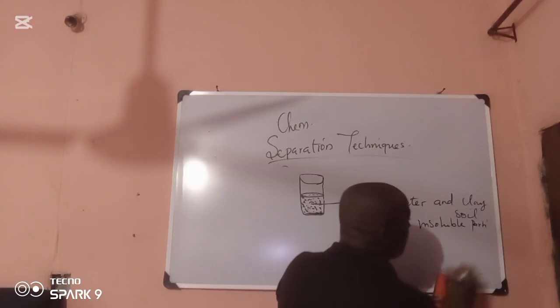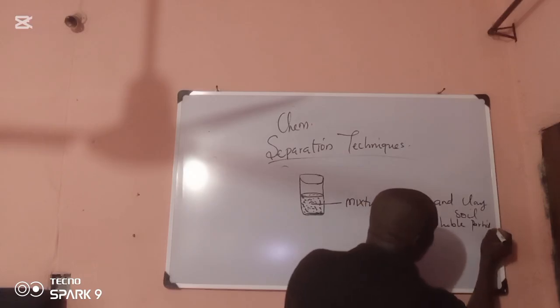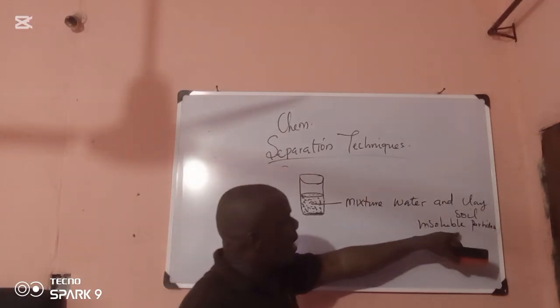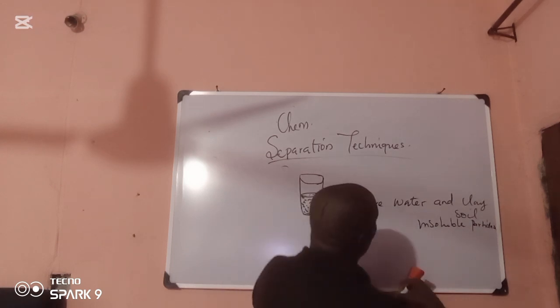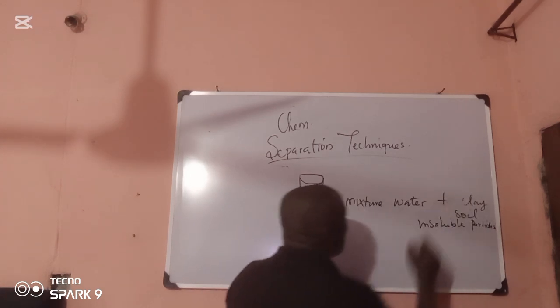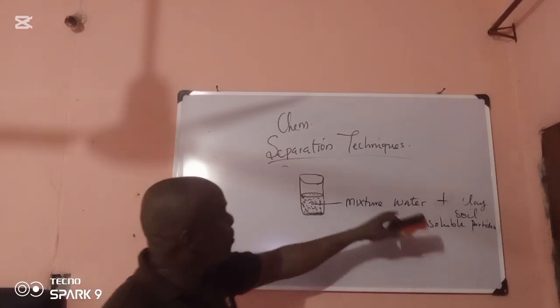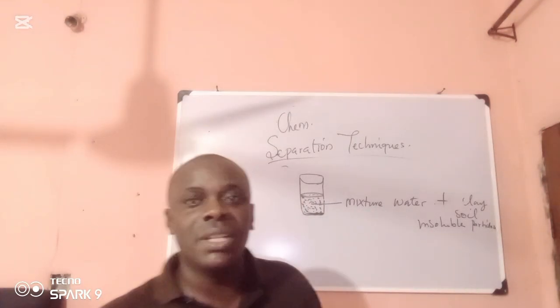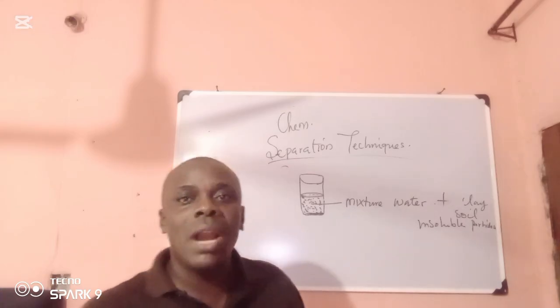You have insoluble particles with water. You allow them to settle for a period of time, let's say 30 minutes, an hour, or more than one hour.